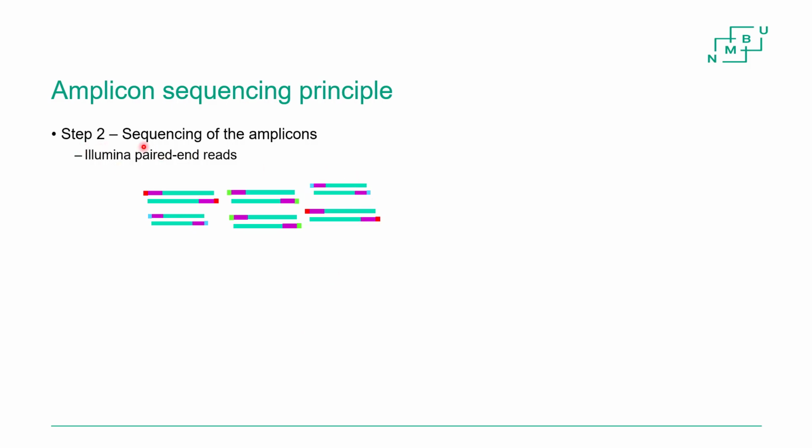So when it comes to the actual sequencing, we now have these amplicons from various samples. You can see by the various barcodes here, they are all amplified from the 16S gene, right? With this primer. The primer is the same in all samples, right? Primers are the same.